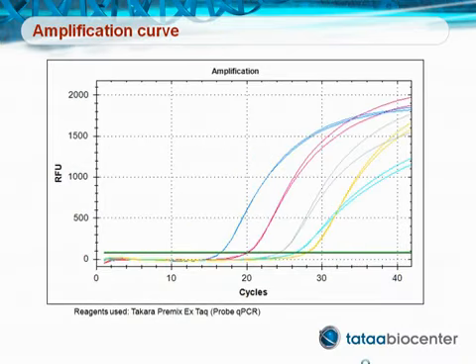If the PCR reaction is inhibited, you may also have a different slope of the amplification curve, as I have mentioned before. This can sometimes be detected by visual inspection. You can see here that the aqua-colored curves have a different shape and slope than the other. You should be careful and remove curves with wrong slope, as they will not be accurately quantified because they will have a higher CQ value than they should.